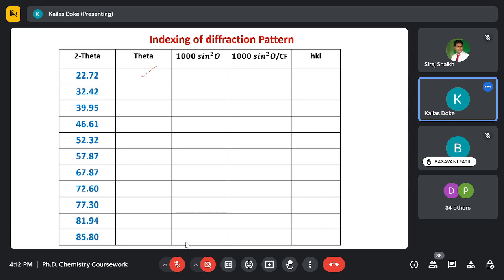In this case, I have selected the first number as a common factor because 77.93 minus 38.80 is almost identical to 38.8. 116.64 minus 77.93 is again close to 38.80.